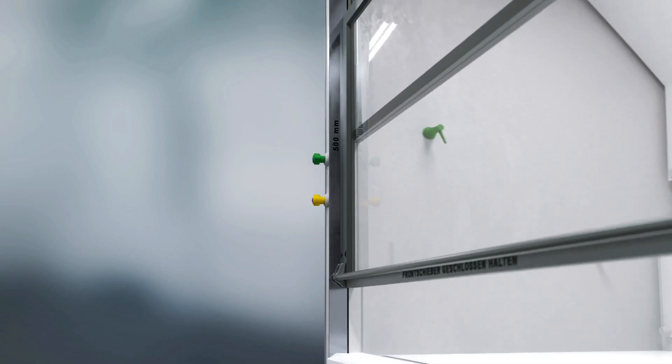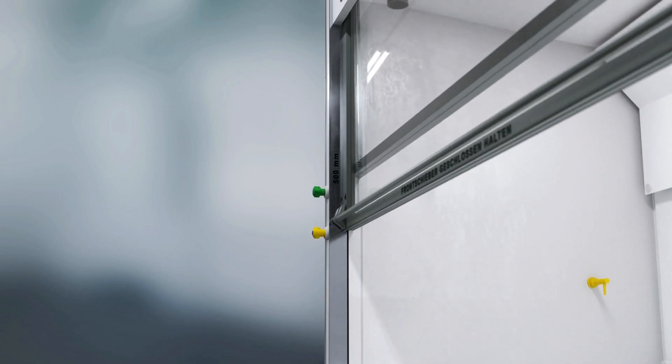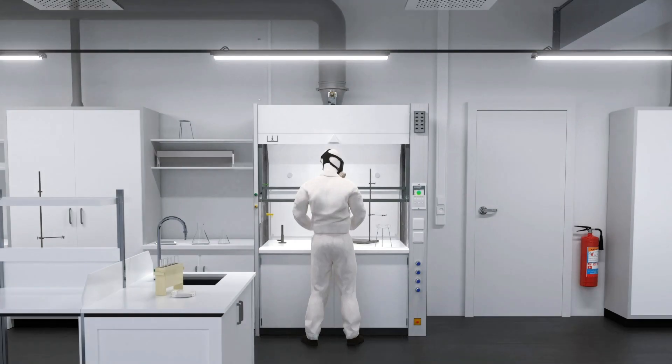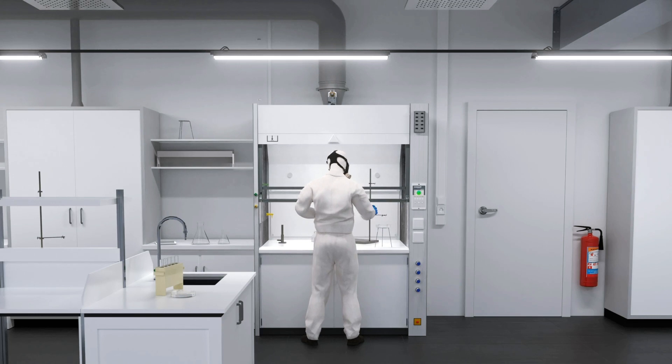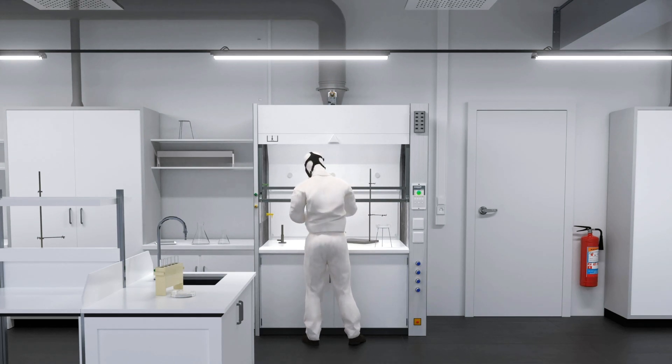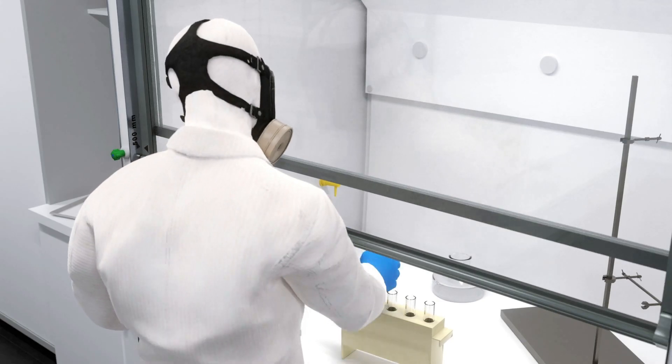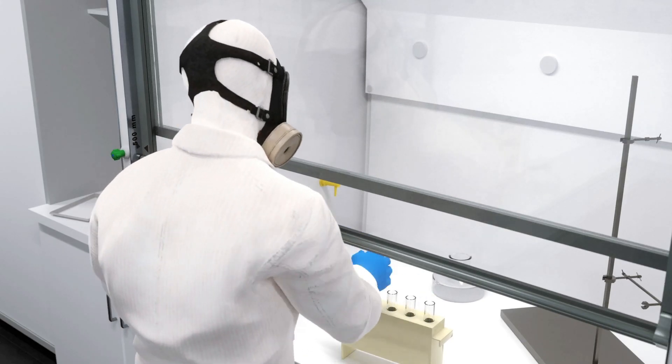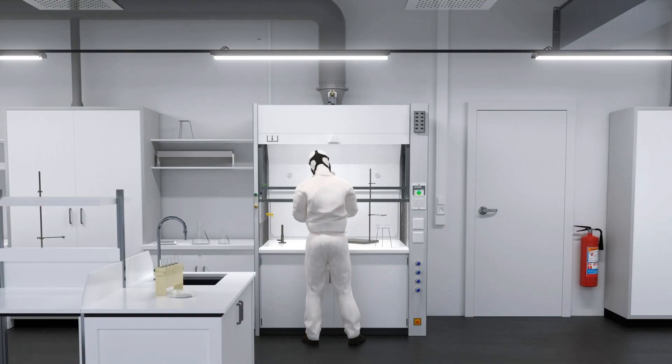In general, the recommended height of the vertical front sash opening is 500 mm. This opening height and the side glass sash stabilizes the exhaust airflow and provides researchers with an optimal workspace.